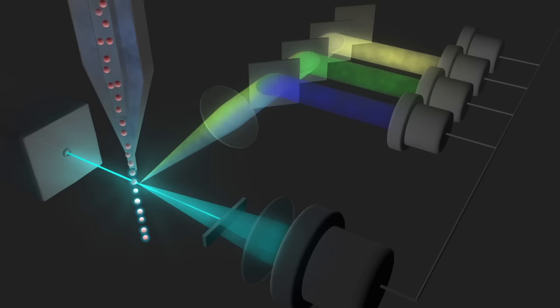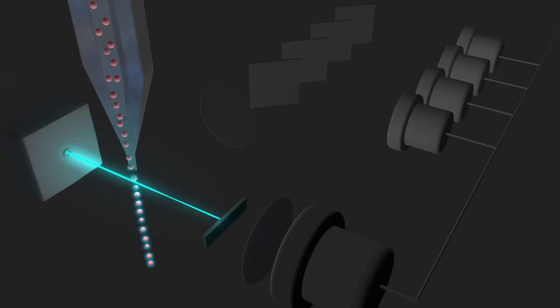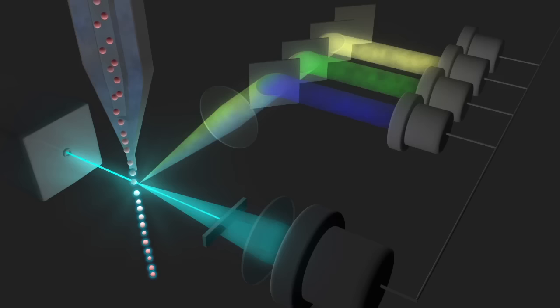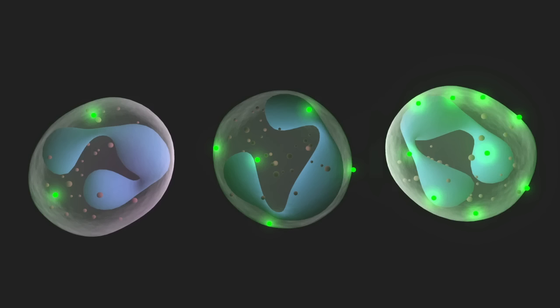the light emitted by the fluorophore is directed along a path with emission filters that allow for the detection of multiple different fluorophores emitting light in a cell. A flow cytometer can detect the presence of a fluorophore and also quantify the relative amount of a fluorophore within a cell.